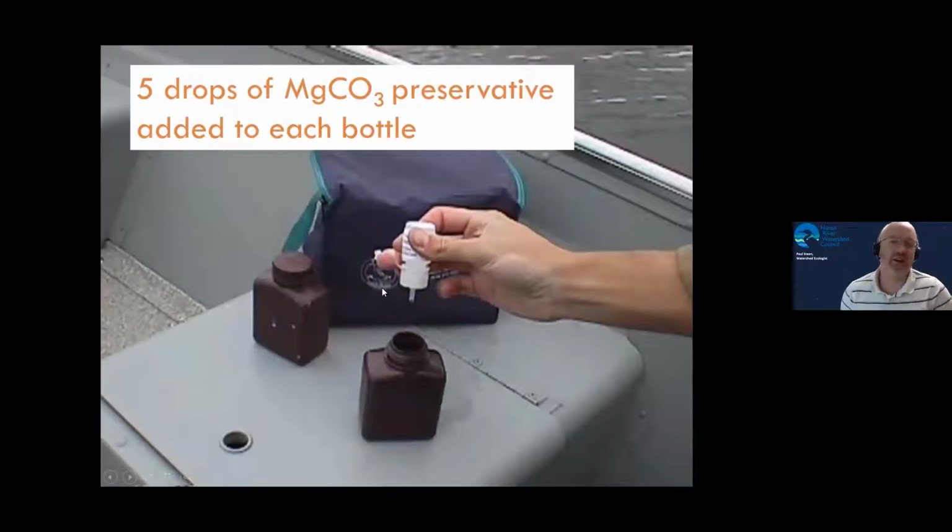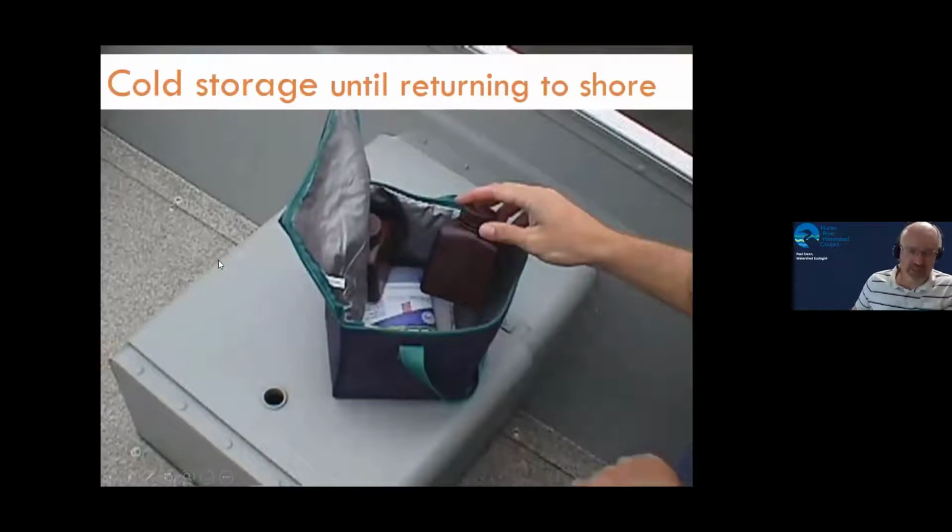Then you're going to take your magnesium carbonate and add 5 drops to each bottle. And again, gentle mixing, gentle inverting. And you put that in your cooler on cold storage until you get back to shore.